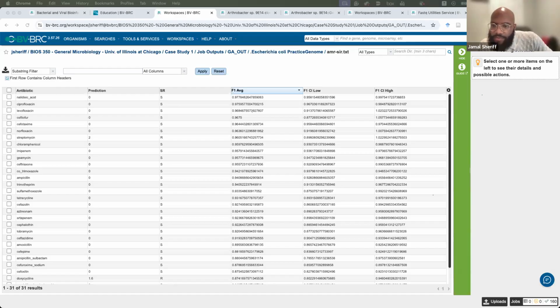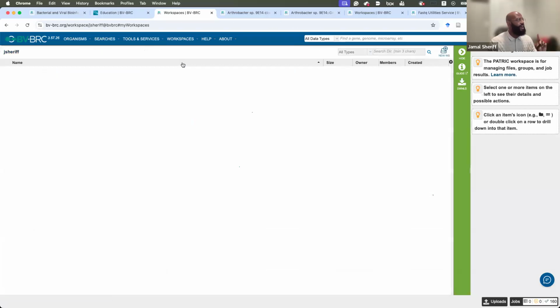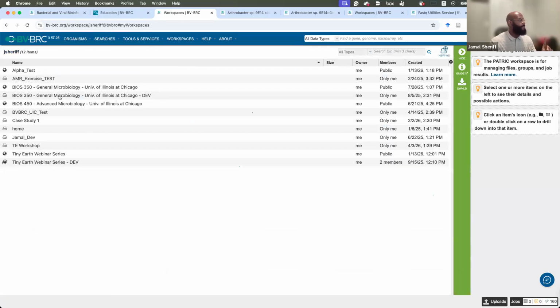I can read it to you if you want. The heat map: what job output file from taxonomic classification did you select to view the heat map? Yeah, so for the heat map, I hadn't shown you because for this exercise, we only have one sample.